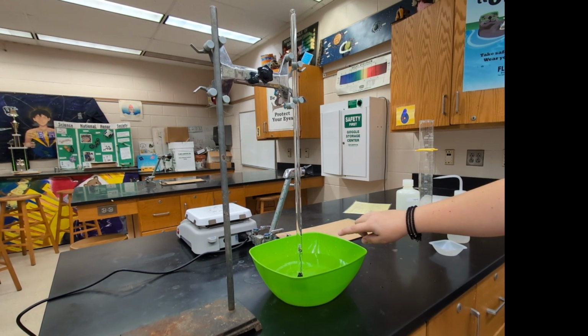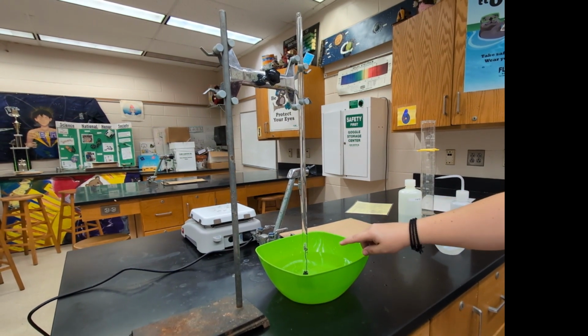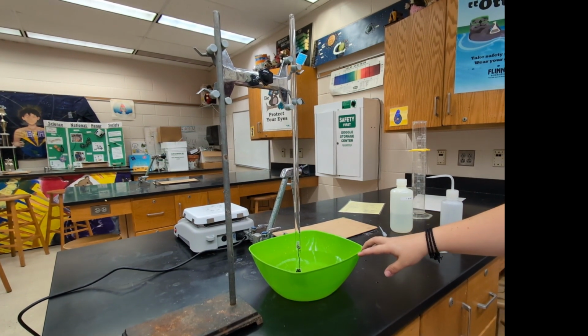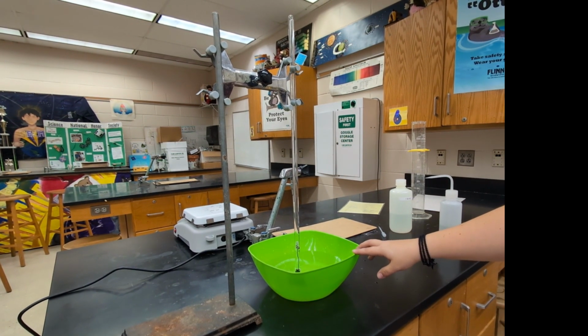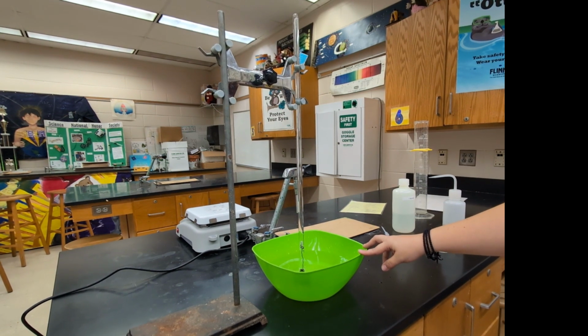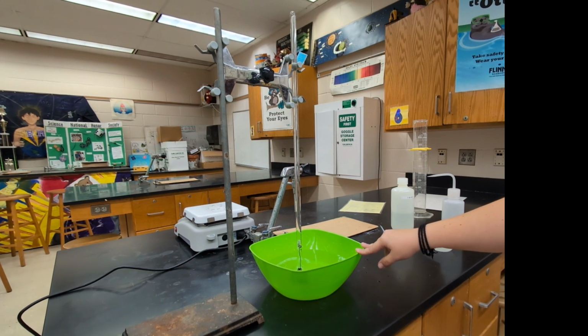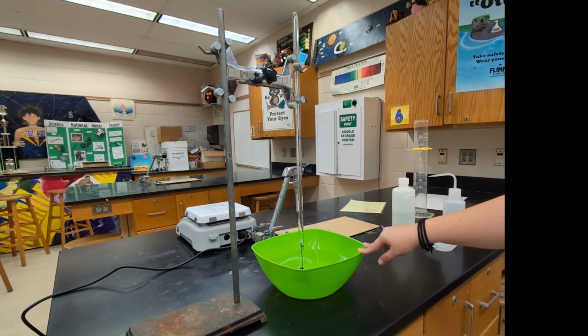You'll know that the reaction is complete when you stop seeing the bubbles, and most of the magnesium should be reacting. Now, in theory, all of it would react because it's our limiting reagent, but in practice, you're not going to see 100% of it. But really, once the bubbles stop forming, that's going to show you that the reaction has finished.